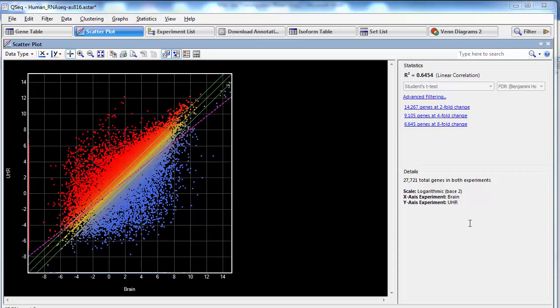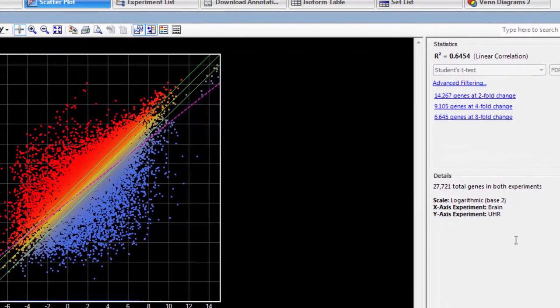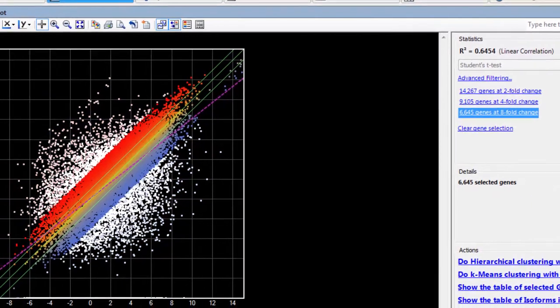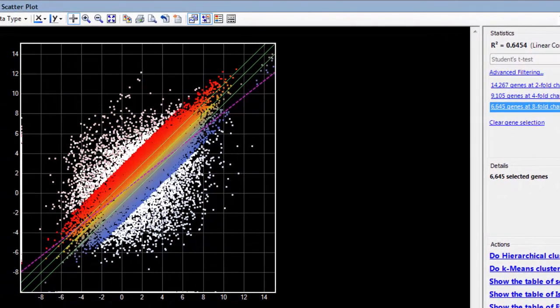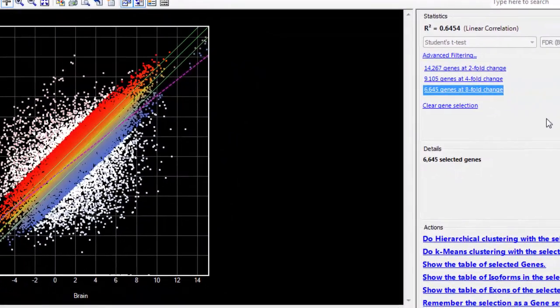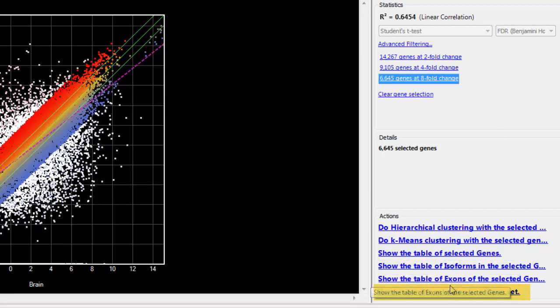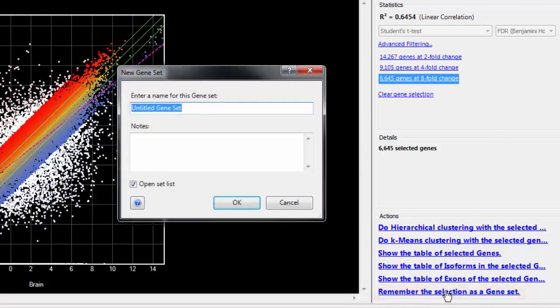For example, in the scatter plot here, I can click on the quick link to select all of the genes that have an 8-fold change. And once I have a selection made, I can then click on remember the selection as a gene set to save those selected genes as a group.